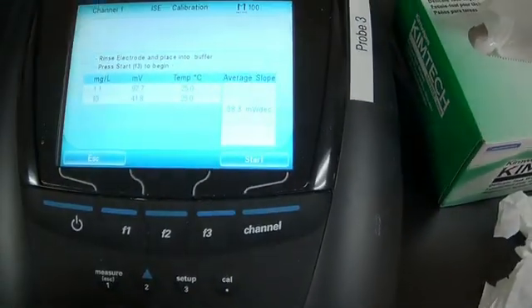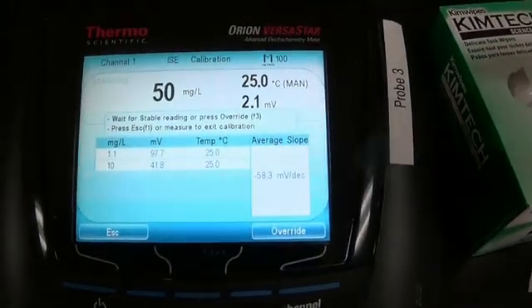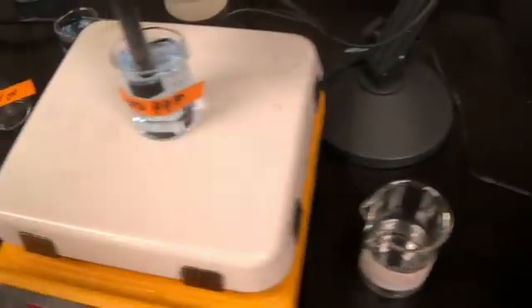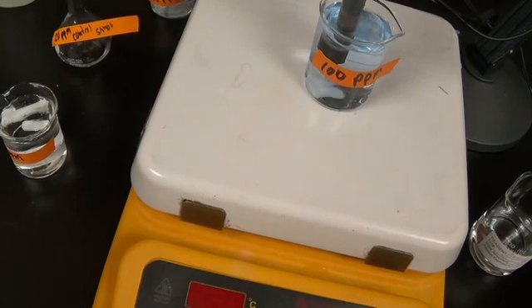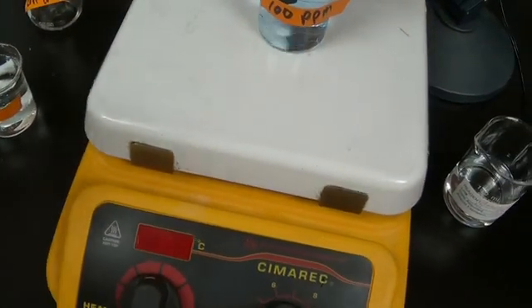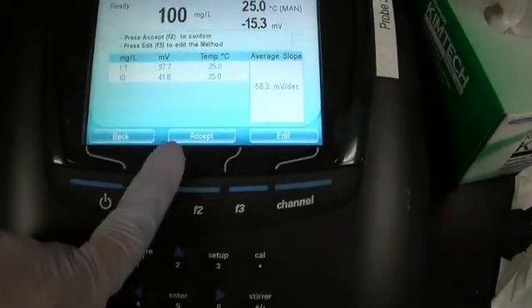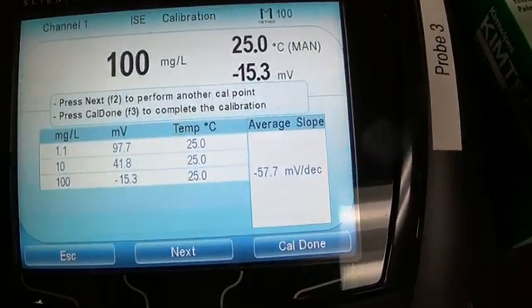Next. Start. Wait for it to stabilize. Let's check the pH. Alright, it is ready. I'm going to hit accept. So our calibration is done.